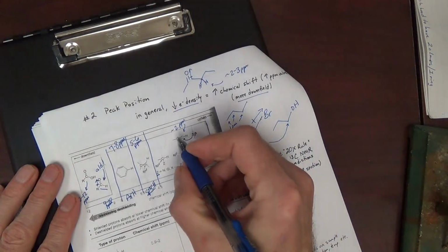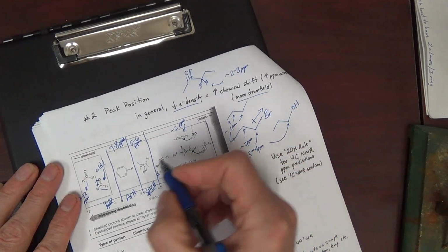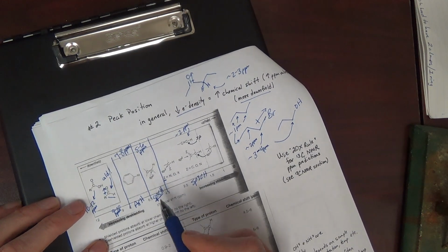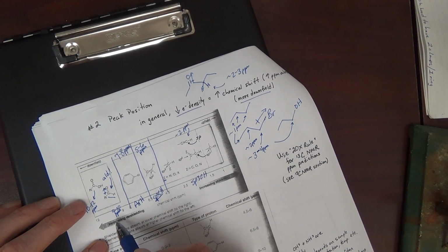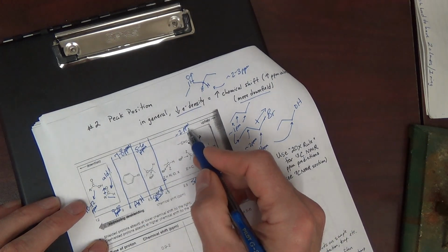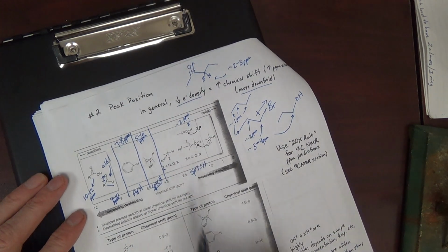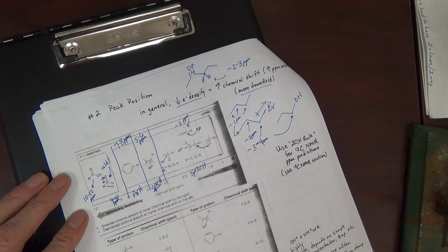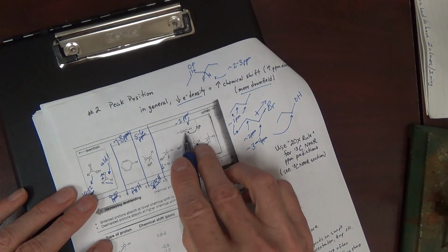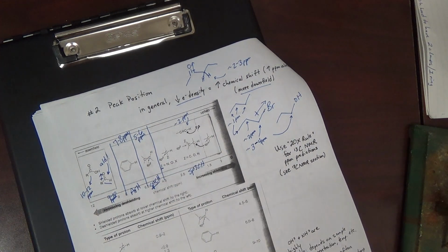Oh, let's go back here. We went from sp3 CH, sp2 CH, but what about the sp CH? It's actually back upfield at about 2 ppm. So it's not really a trend there. The reason why is worth explaining.